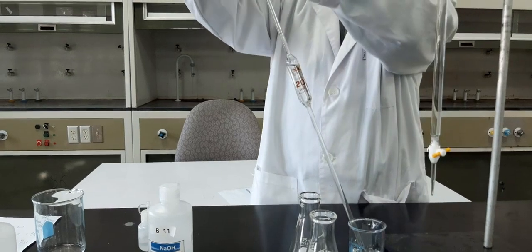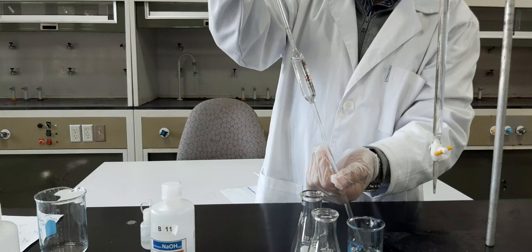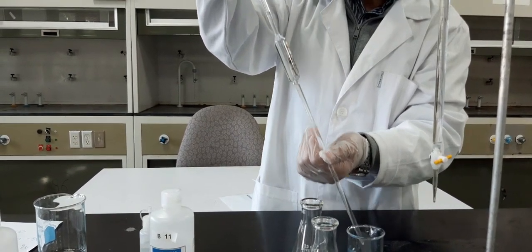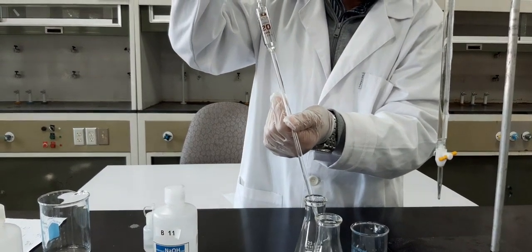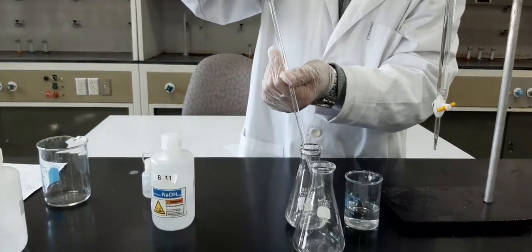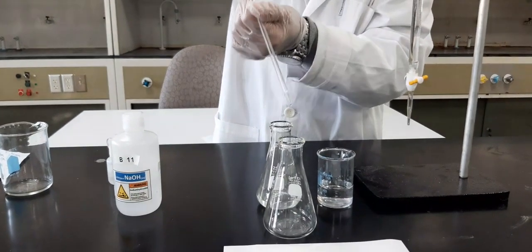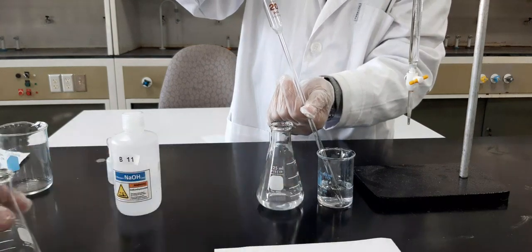after we take 20 ml. Let's see. We take 20 ml, and then we transfer it to the first conical flask. Make sure that all the apparatus is washed with distilled water before starting your experiment. So we will deliver 20 ml. We will not go anywhere. There is another conical flask, so we will take another 20 ml in another conical flask here.